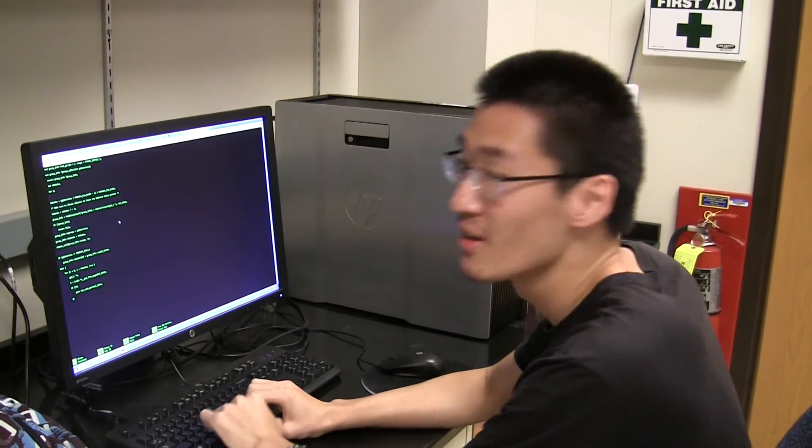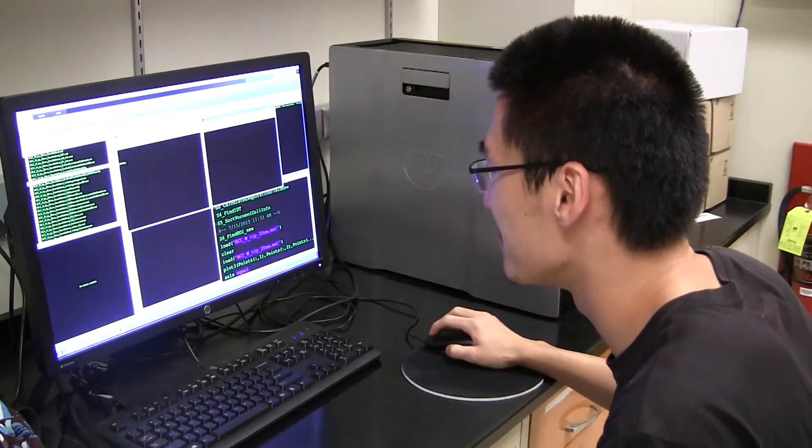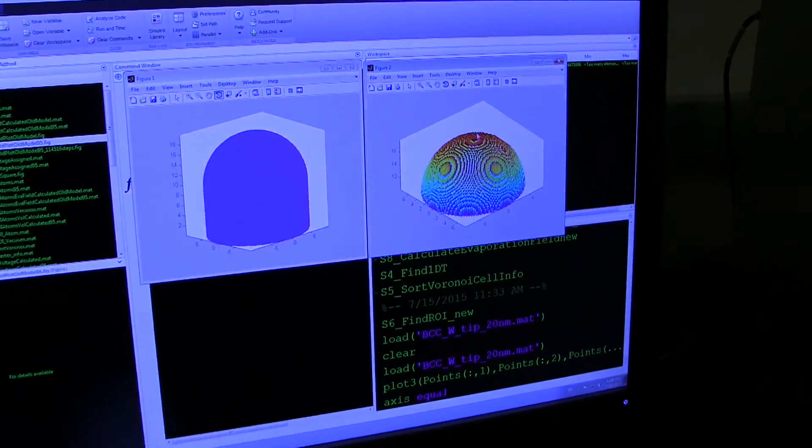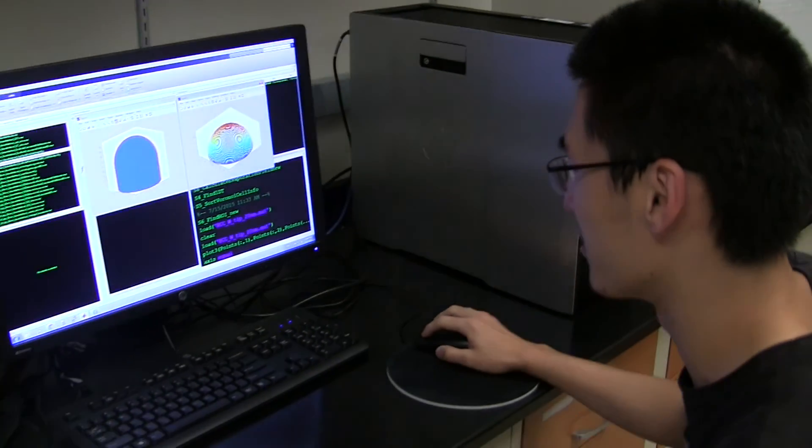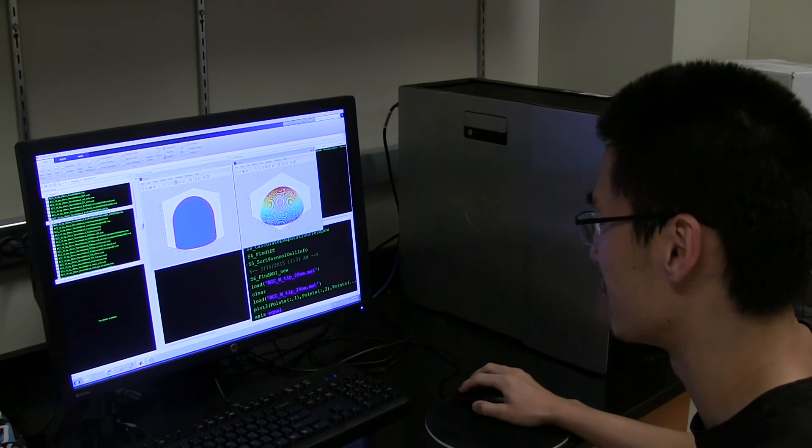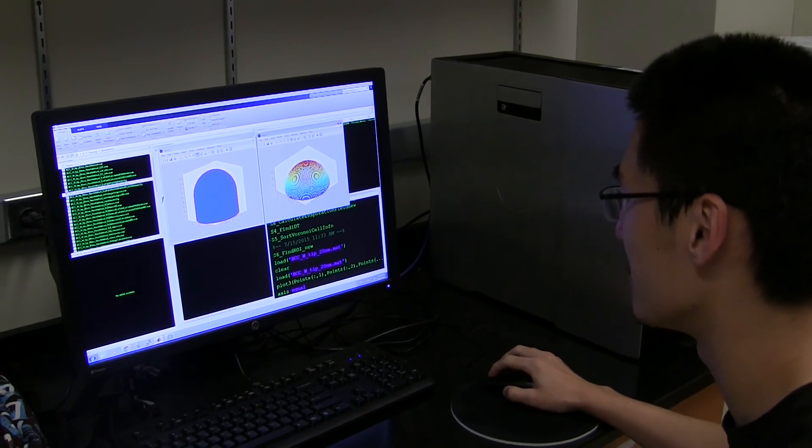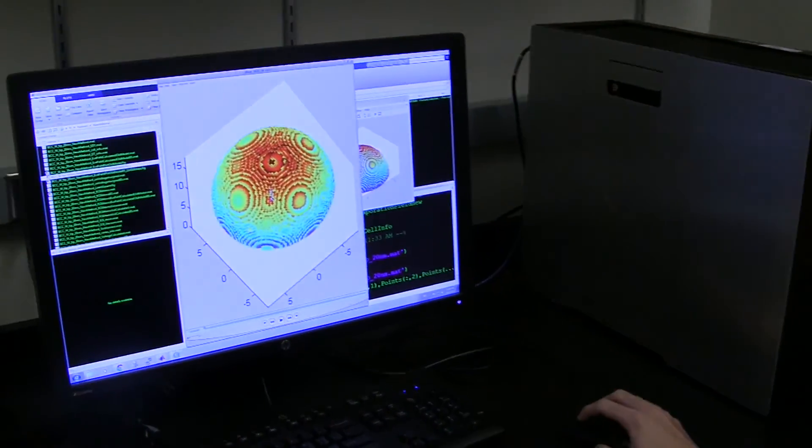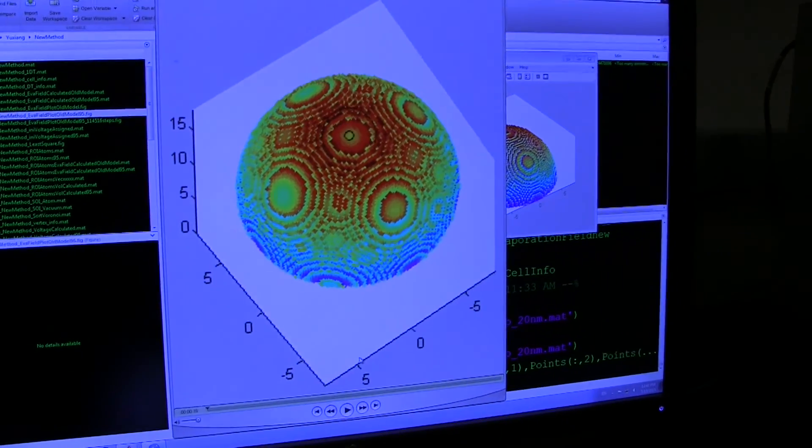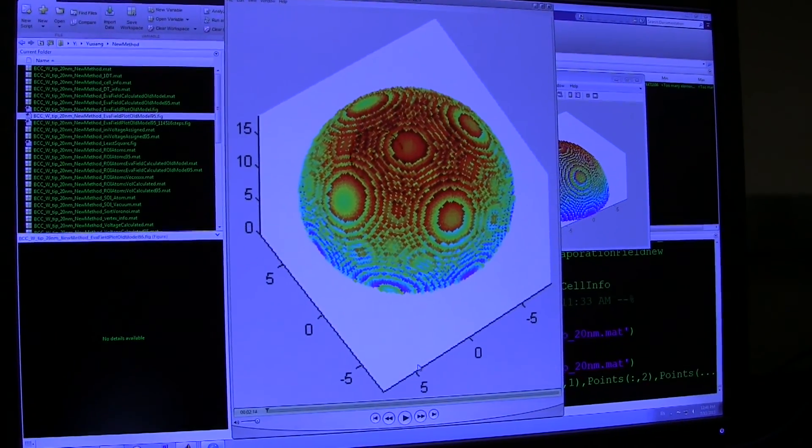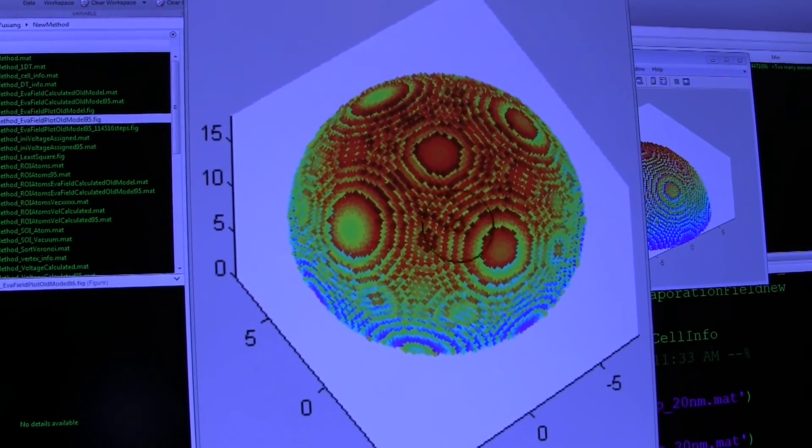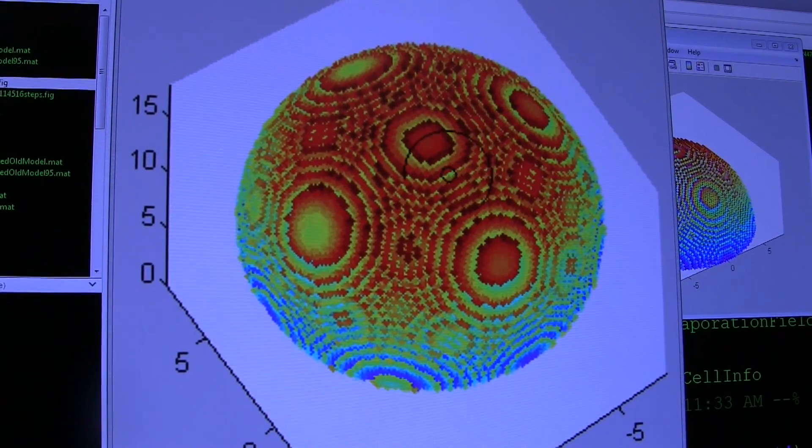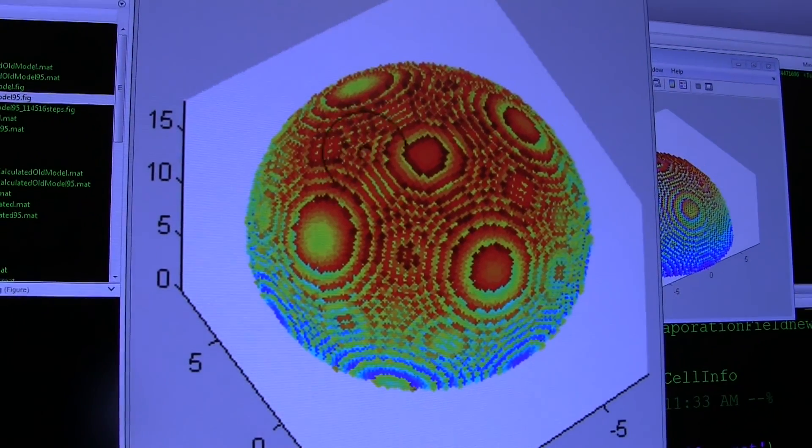Hey Sean, what are you doing? Oh, I'm glad you asked. Here, I'm building a model of the tip. And I will evaluate the potential and electric field on the top of the tip. The red color represent higher electric field and the blue color represent lower field. And then I can run the simulation. Here is a video of the simulation. As you can see, the atom is evaporated one by one. And by collecting the information, we can improve the reconstruction scripts and get better results.